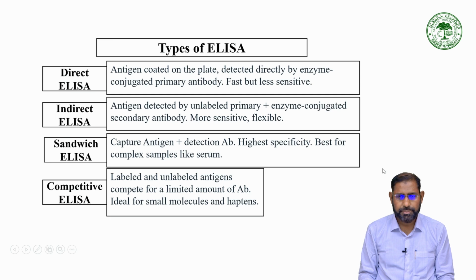Types of ELISA: direct ELISA, indirect ELISA, sandwich ELISA, competitive ELISA. The types of ELISA depend on the antigen.